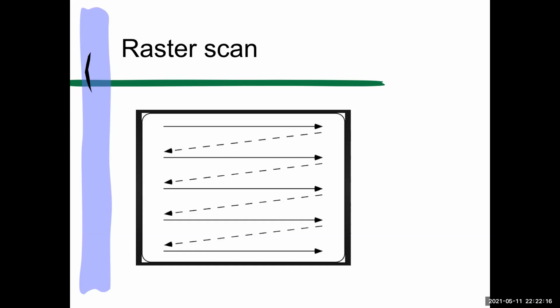Then you might scan again for the next color and then step down the motor and then get the next Z slice and the next one and the next one. You might end up with 30 to 100 Z slices. It just depends on what you're up to. In the old days, this would literally take me 6 hours to get an image. I was using a Biorad MRC 600, so it was like the second confocal ever made, the second model. Now, to get the same image, we're talking minutes, maybe not even.